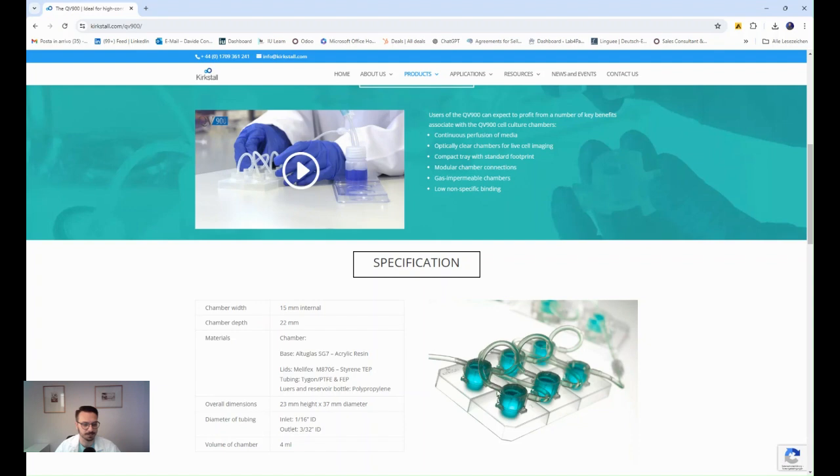You can have them all connected, so having them in series. You can have them connected in couples, so basically 3 sets of 2 different organs, 2 different models, one after the other. You can also obviously have it the other way around, with 2 sets of 3 organs, but in reality also here the combinations are quite large.